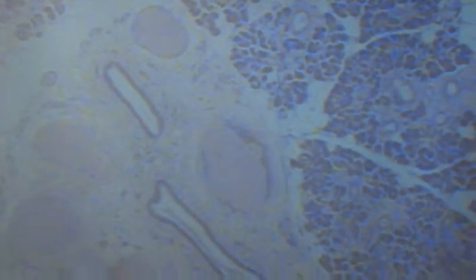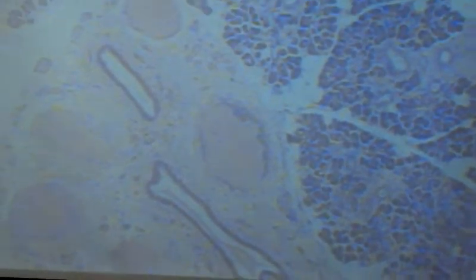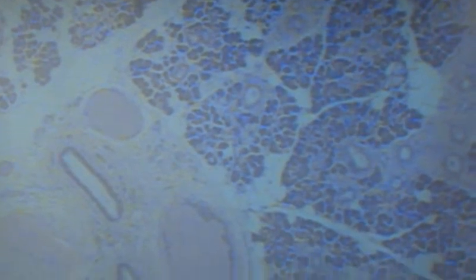But because parotid is serous, and because this is one of the common questions I get, I want to mention it now. If you're looking at the triple mount, one of them will be the parotid, which has serous cells only.